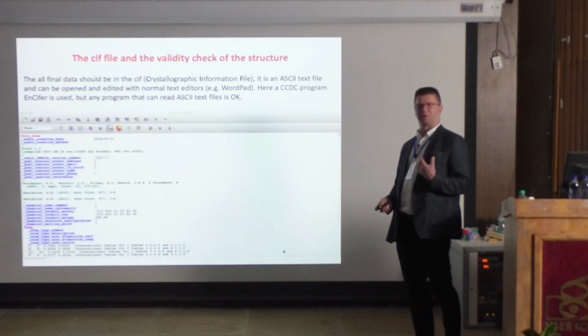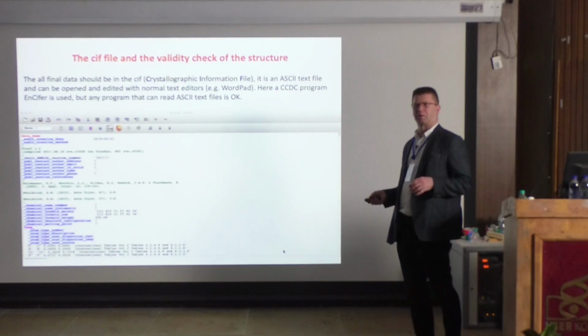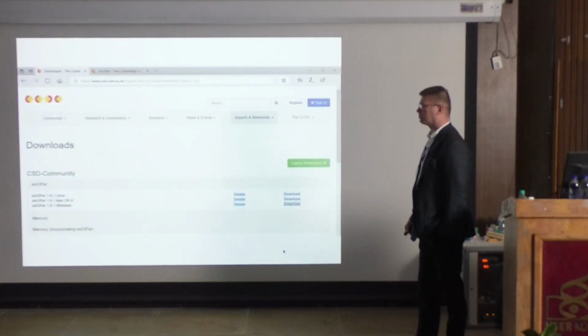But if you have this information, you can go and edit. You can type it there. Like there, it says publication contact author name. I would write here, between these brackets, Karius, and I would be the contact author for this. And this is how it goes. And then it comes here, coordinates, and all the other information is there.